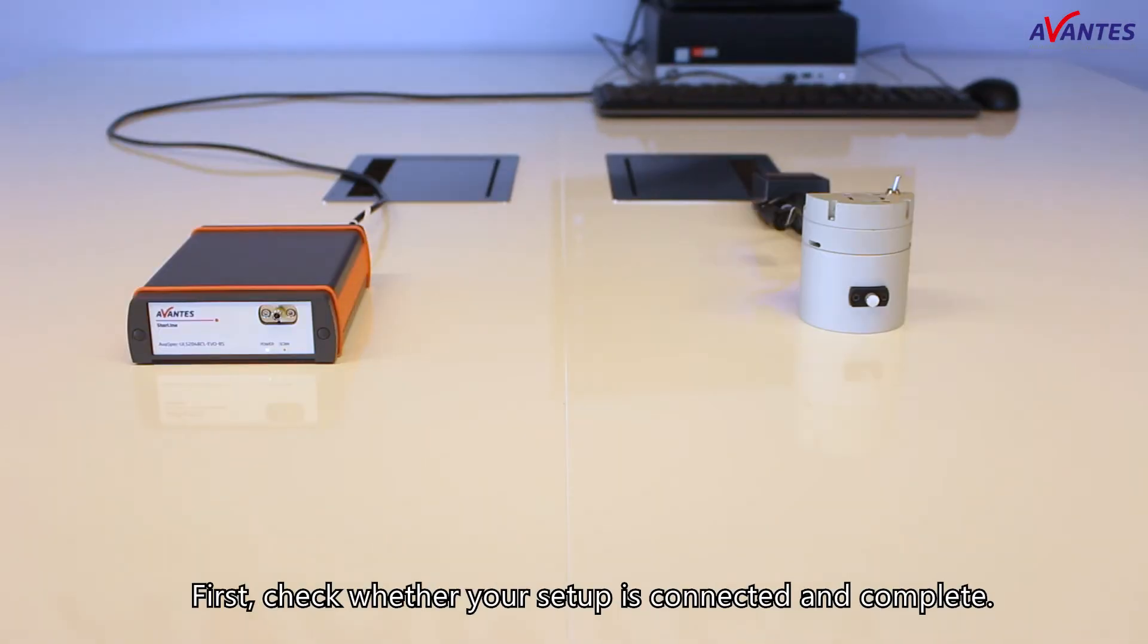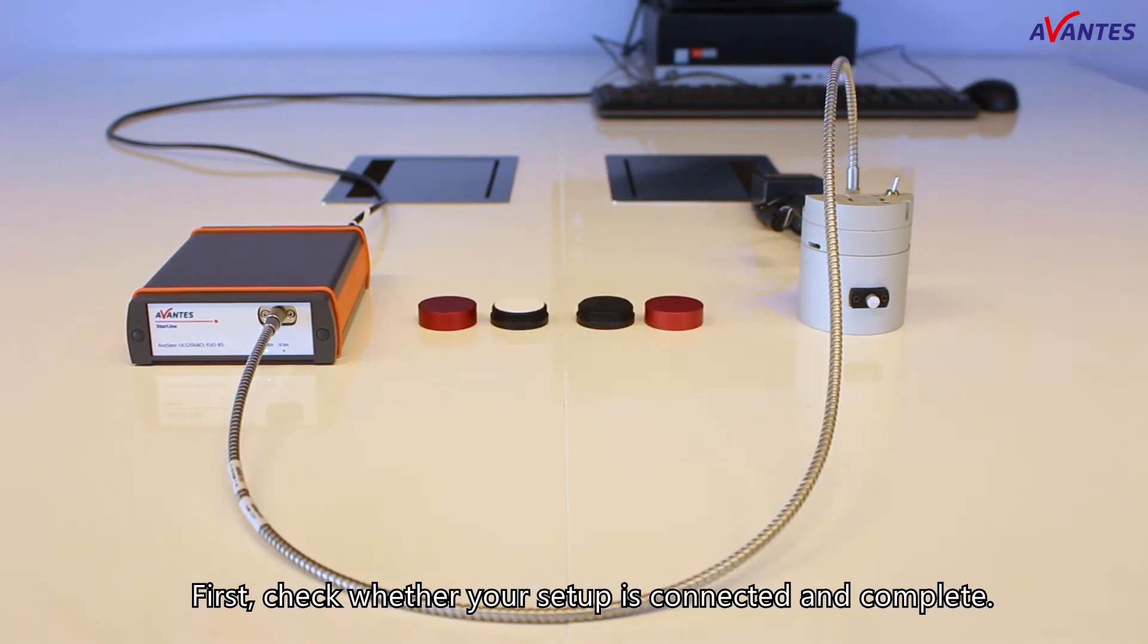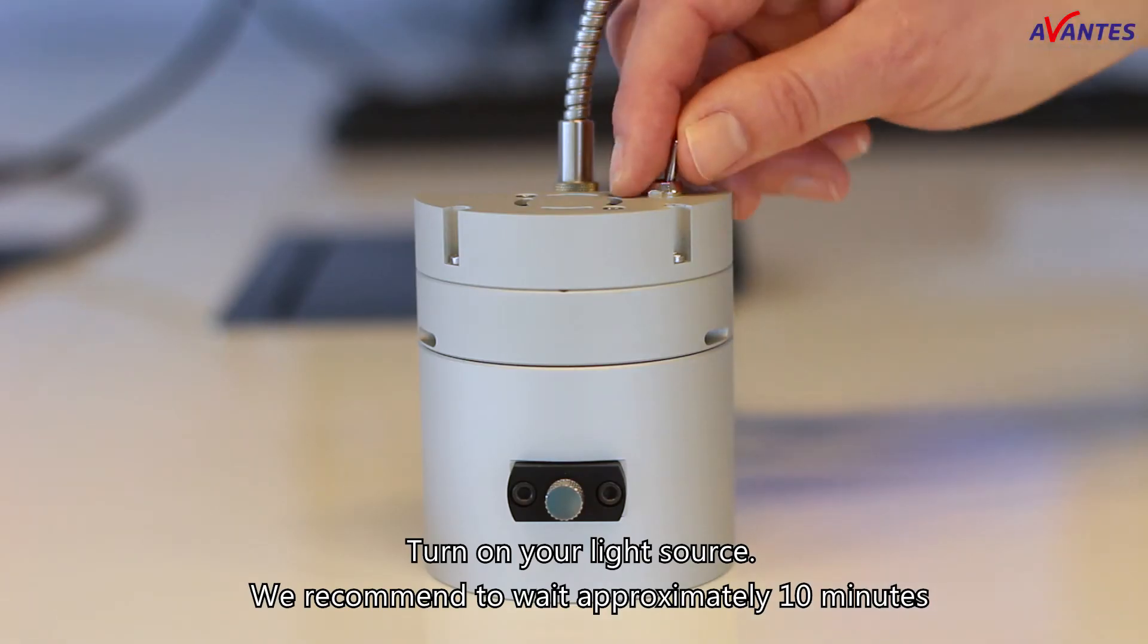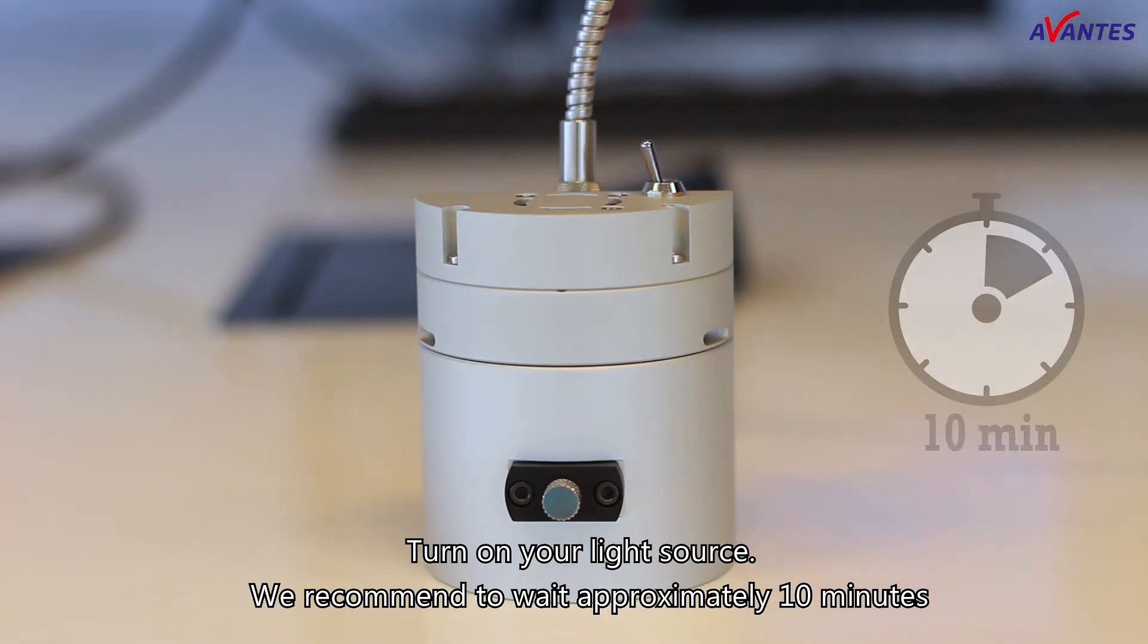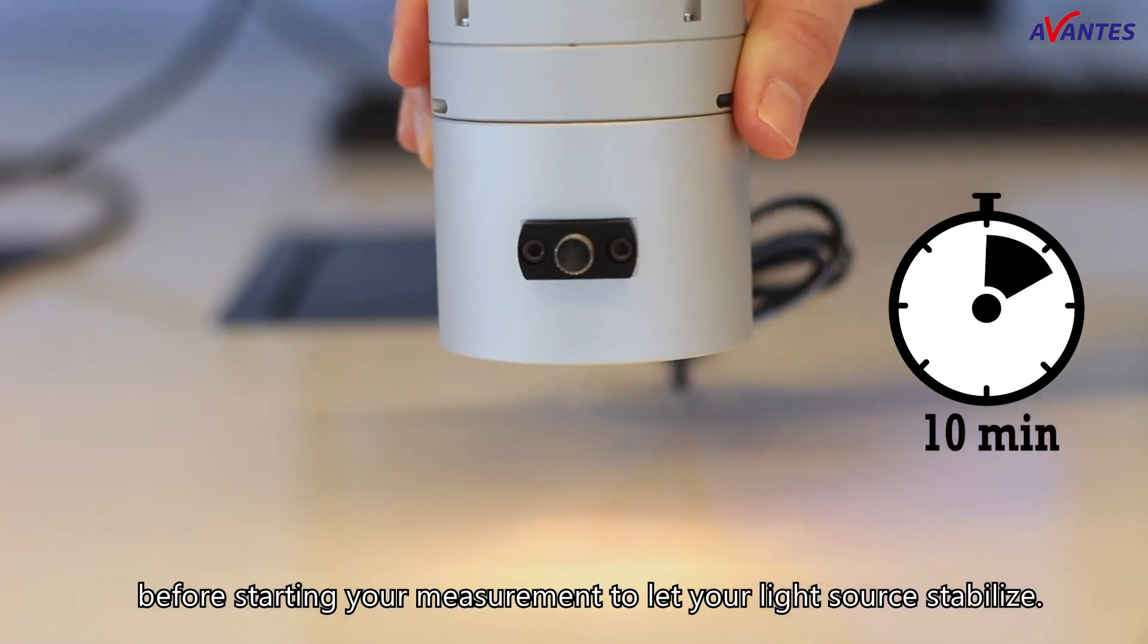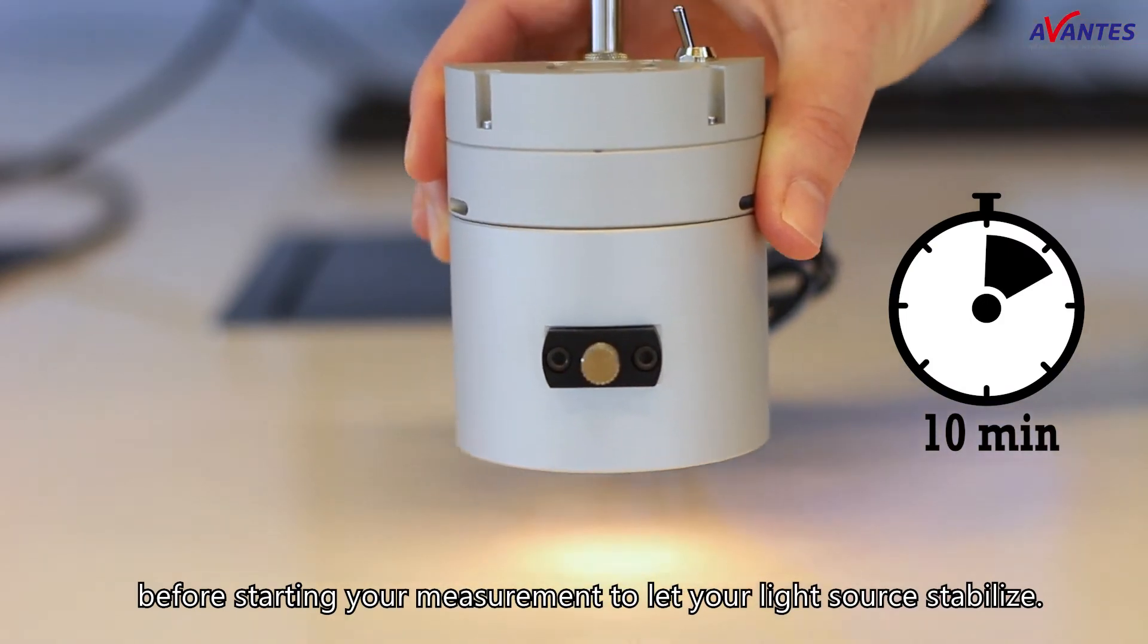First, check whether your setup is connected and complete. Turn on your light source. We recommend waiting approximately 10 minutes before starting your measurement to let your light source stabilize.